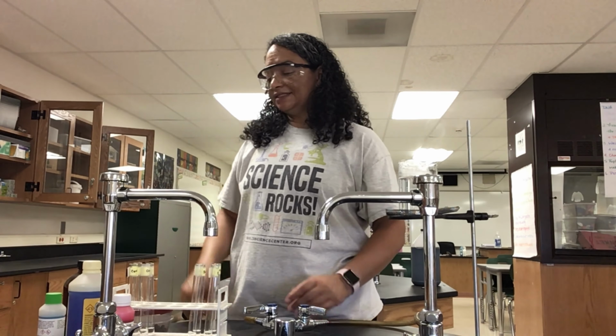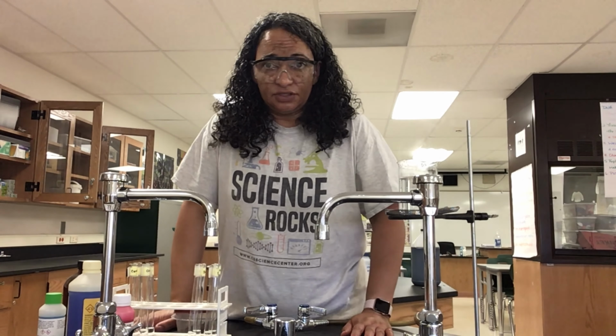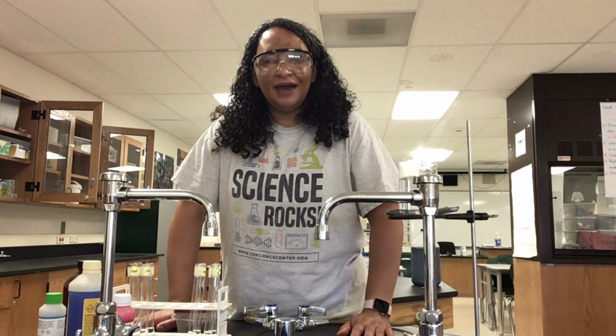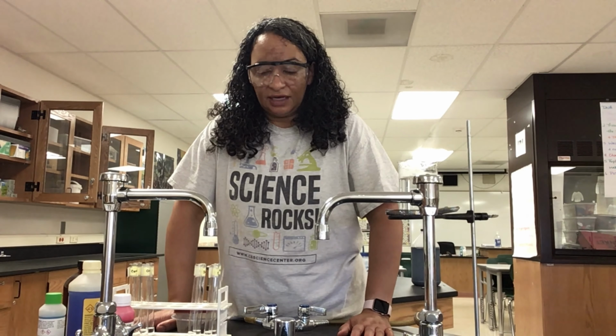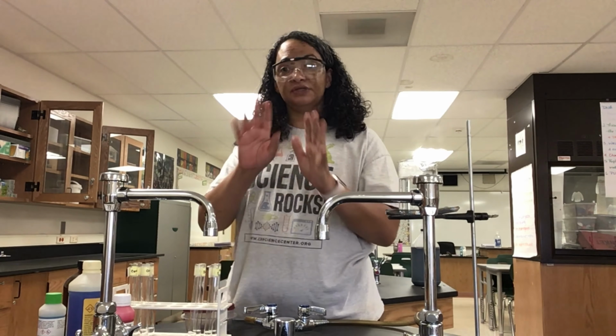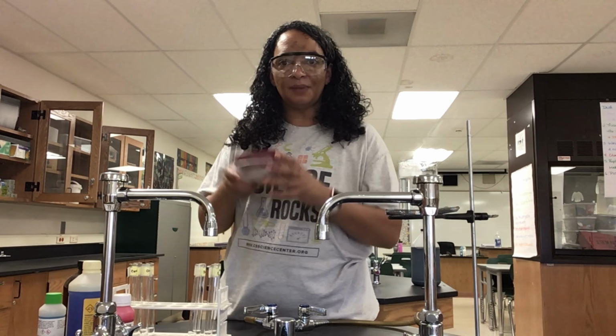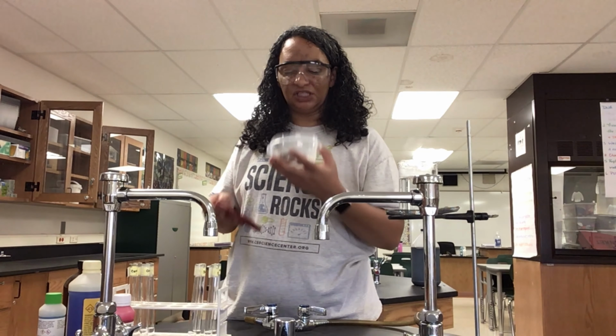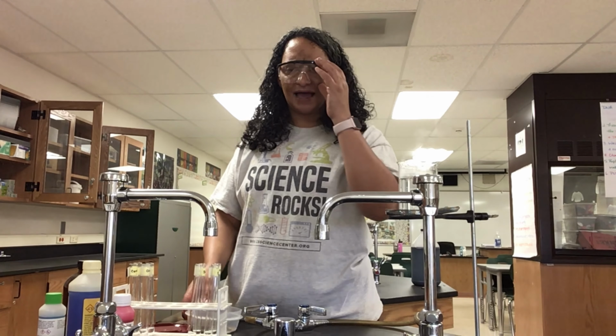All right. And today what we're going to be using to test as our seed is going to be an acorn from my backyard. So I have an oak tree in my backyard, and I really had a hard time finding acorns because this year we had a family of squirrels move in, and boy, those guys are hungry. They've been eating all the acorns, but I was able to find some acorns. I ground them up in my coffee grinder, so now I have a nice acorn paste, which smells really bad. Don't sniff things in the lab.